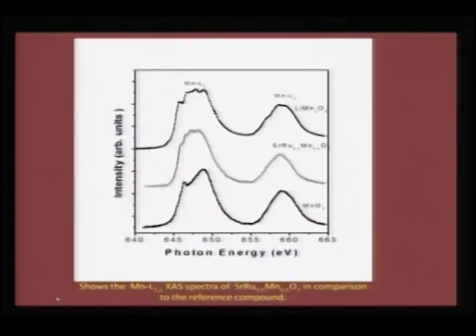And now let us take the same L23 for the manganese core and try to compare this equiatomic composition, that is 50-50 of ruthenium and manganese, and make a comparison between MnO2 and LiMn2O4.